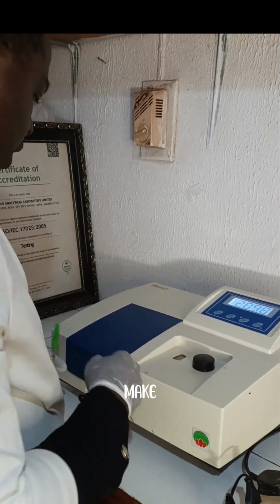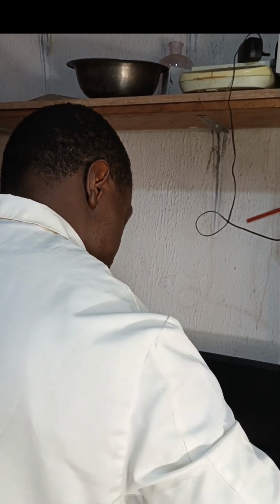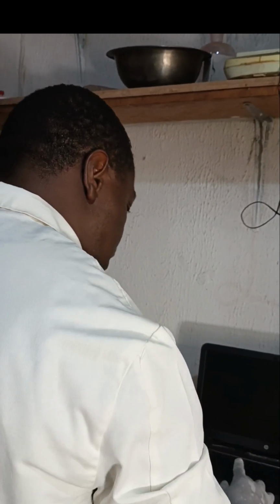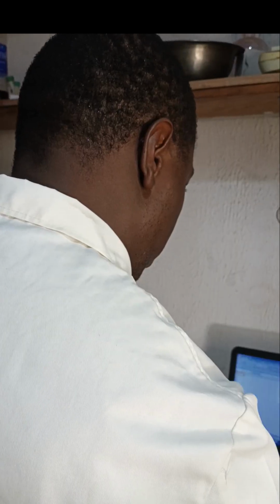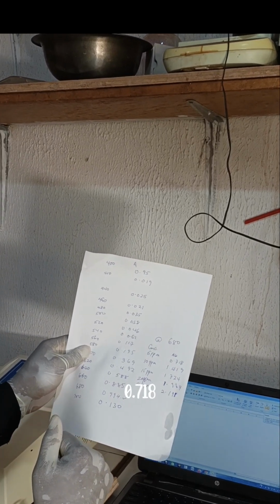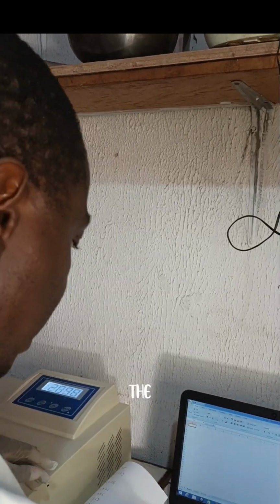Now, in order to make our plots of our calibration, what we'll do is to key in our details. You can see the results. At 5 ppm, the absorbance is 0.718. At 10 ppm, 1.419, and then as it increases. So we make a plot of the Lambert law.